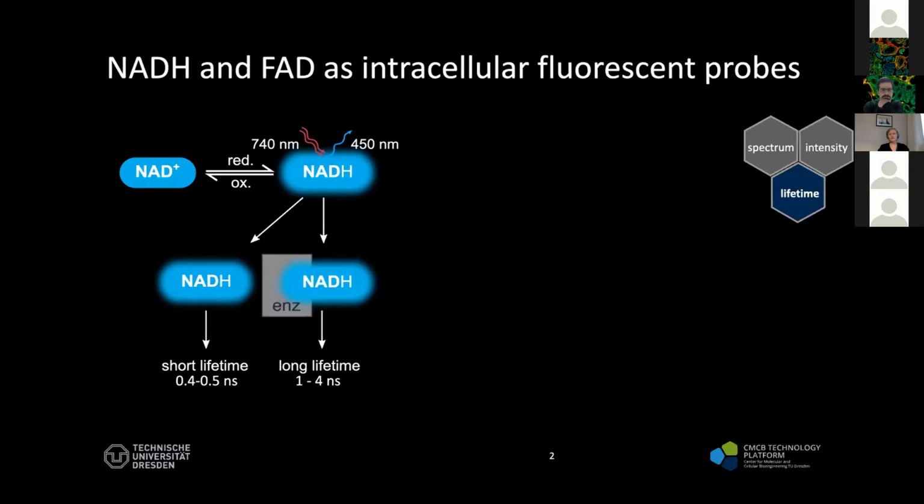However, if it interacts with proteins, in this case frequently enzymes, then this lifetime is prolonged into the nanosecond range. This lifetime lengthening, or these long lifetimes, are very much dependent on the interacting proteins. Therefore, a certain range is given between 1 and 3 to 4 nanoseconds.